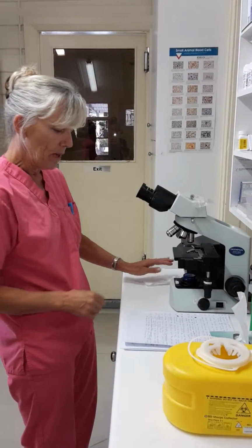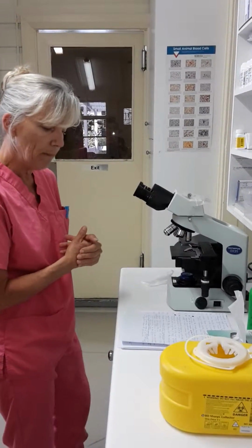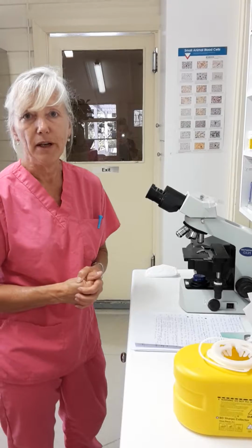In terms of cleaning our bench top, we would use F10 at a dilution rate of 1 ml of F10 to 250 ml of water, and we would leave that on for a contact time of 30 minutes.